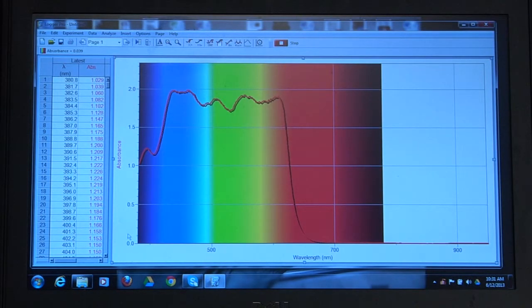So you can see from this is actually 450 to about 750 nanometers. So I'm going to stop this.